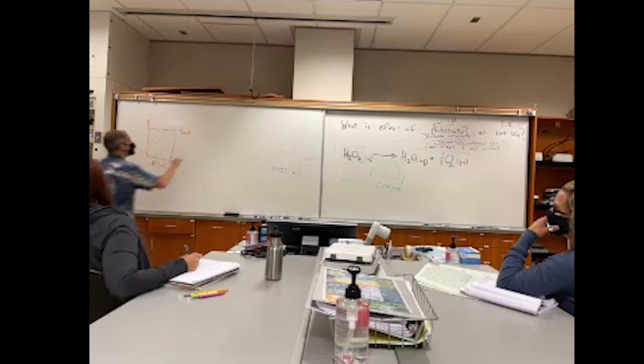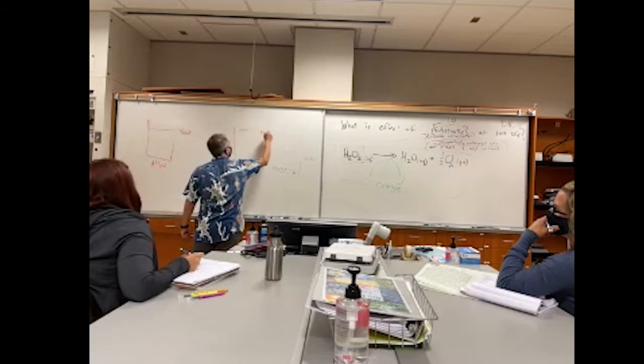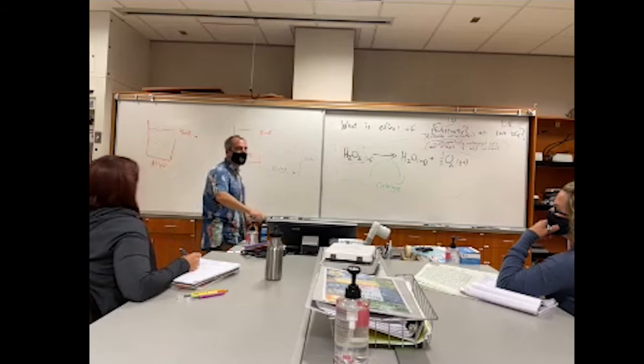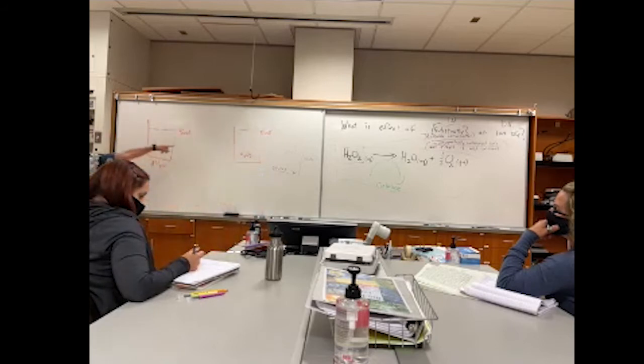0. I have 5 mils, and it's just pure, I'm going to say H2O2, but in reality, it's the 3% H2O2. This would be like 100%. And then I can just do a series of dilutions in between, which we're going to do.